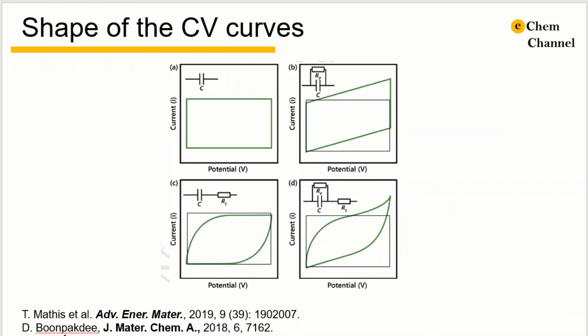Boonpakdee and his colleagues have suggested a way to interpret this kind of differences by building physical equivalent circuits composed of capacitive and resistive elements. A blunt CV curve indicates there is an equivalent series resistance here. A slant CV curve is due to equivalent parallel resistance. And a blunt and slanted CV curve is due to the existence of both elements.